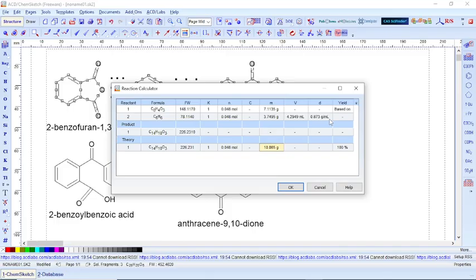Now see what we are going to do. We are going to calculate the concentration. That is what we will do. When we calculate, the software number one cannot literally tell you the exact volume to be used in the reaction.